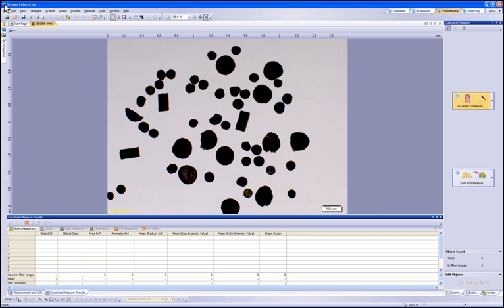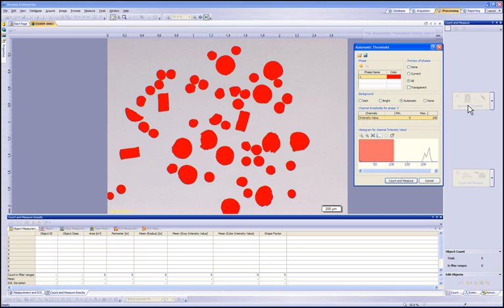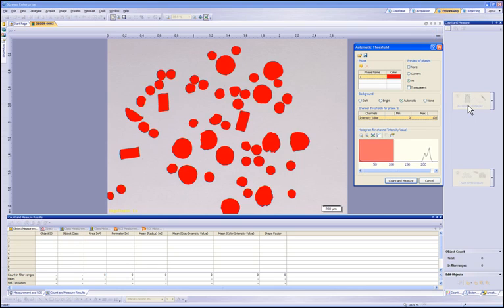Threshold is the software's ability to distinguish between intensity values or color values to mark them against a background. Let's select the automatic threshold. The stream software will determine the best level of threshold needed for the sample image. This automatic detection works very well.